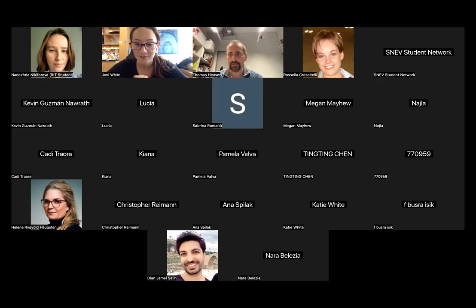Let me take a look. Sorry, I was just distracted. Apologies. That's okay. Do you want me to ask it again? Yes, of course. So it's from Lucia, and they've asked, what are recommended buffers to use in conventional transmission EM for EVs coming from plasma, serum, or saliva?